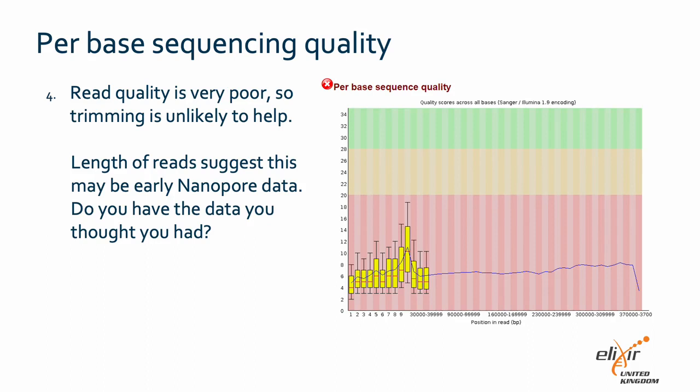Reads with such poor scores as seen here are unlikely salvageable, as a Phred score of 4 reflects a 2 in 5 chance the base is incorrect. This plot raises the important point: are your data what you thought they were? Always have checks in place.